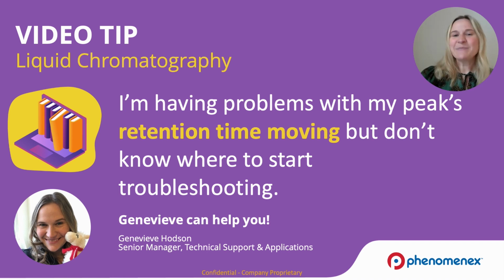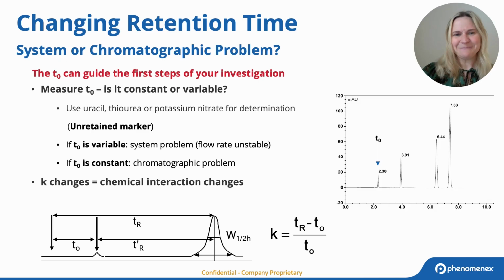So it comes from a customer, and the customer's question is, I'm having problems with my peaks retention time moving, but I don't know where to start troubleshooting. Troubleshooting can be pretty daunting, so let's try and break it down a little bit.